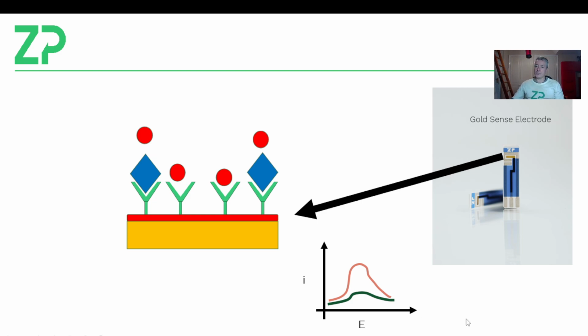Okay, so reproducibility, you fundamentally don't have a reproducible screen-printed electrode. The pipetting steps, when you're trying to functionalize that probably by hand, are probably not reproducible. The testing steps, unless everything is really controlled in terms of time and temperature of test, then you've probably got reproducibility issues there, and all these things stack on top of each other.